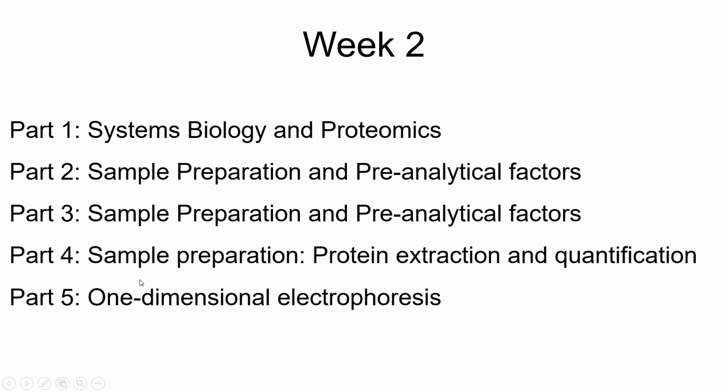In terms of week 2, a bit of systems biology was discussed. This is a broad overview of it, because systems biology is everywhere. So I tried to relate that topic to proteomics. It can be related to genomics, proteomics, metabolomics everywhere, because we are studying the system ultimately, and in that system we are only studying the protein part. So it's proteomics. Then how exactly samples can be prepared, how they can be analyzed, how protein extraction can be done, and how SDS-PAGE can be performed, which is one-dimensional electrophoresis.